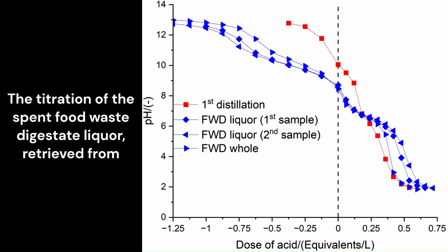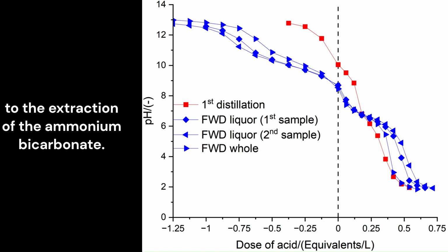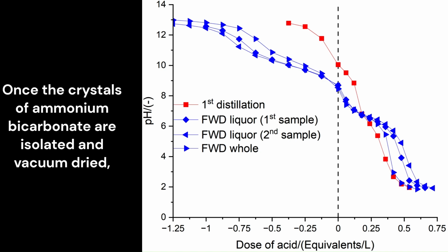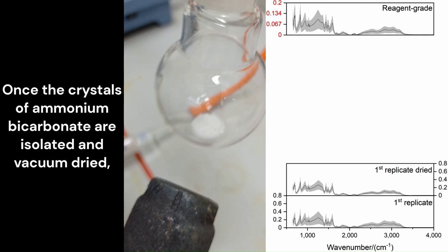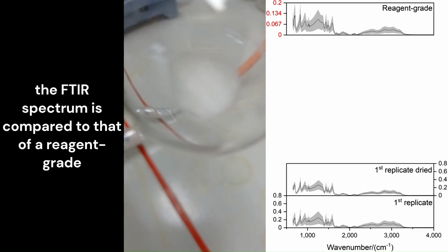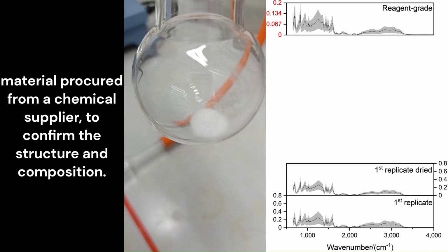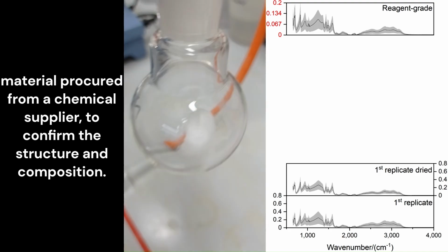The titration of the spent food waste digestate liquor retrieved from the reboiler after the distillation shows lower buffer capacity due to the extraction of the ammonium bicarbonate. Once the crystals of ammonium bicarbonate are isolated and vacuum dried, the FTIR spectrum is compared to that of a reagent-grade material procured from a chemical supplier to confirm the structure and composition.